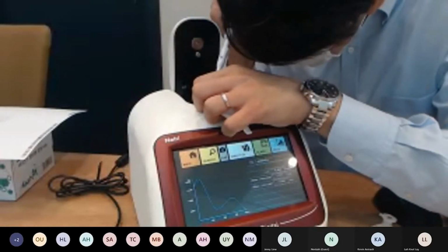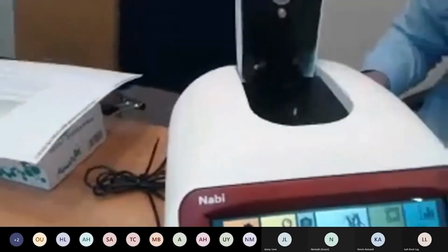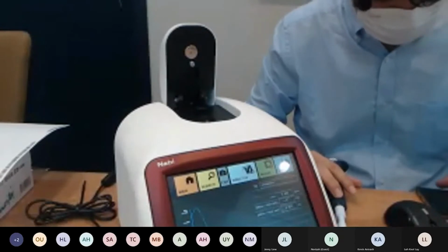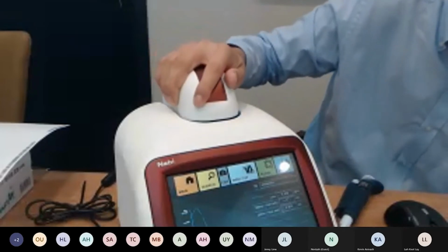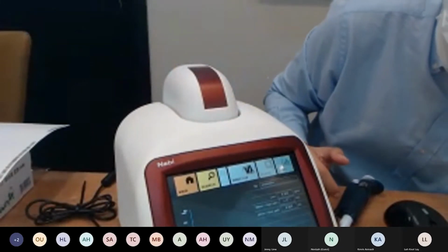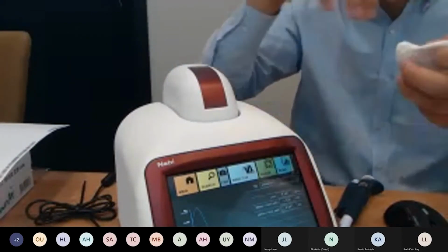Yeah, let's see. I'll just show you, as an example, how it looks when it has bubbles on top. If it has a bubble, then you really should not measure it because that will mess with the results. The light passing through it will not be able to measure properly. Hopefully this won't, because the bubble just stopped. Yeah, so it's fine so long as there's no bubble. 6.947.